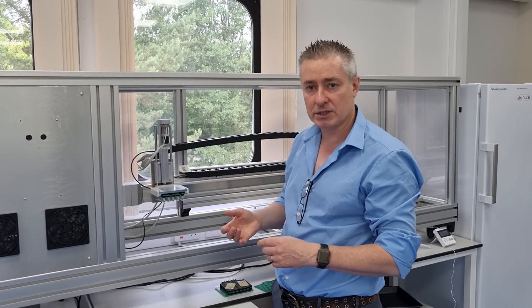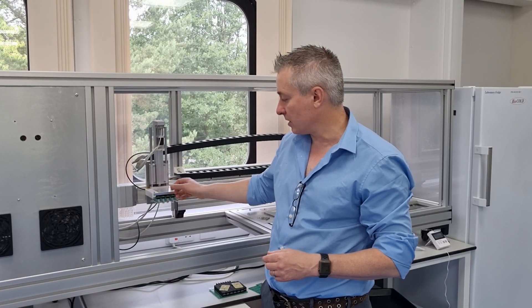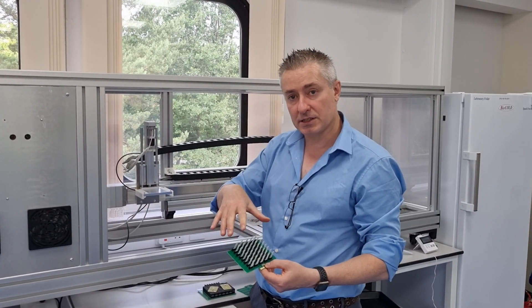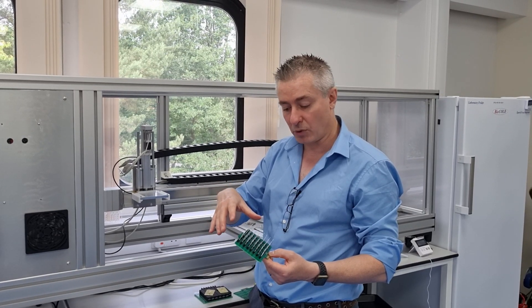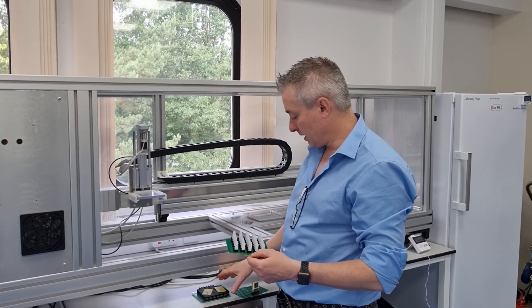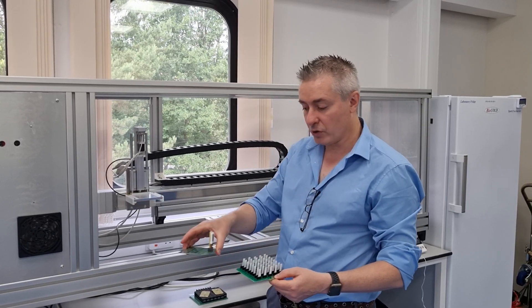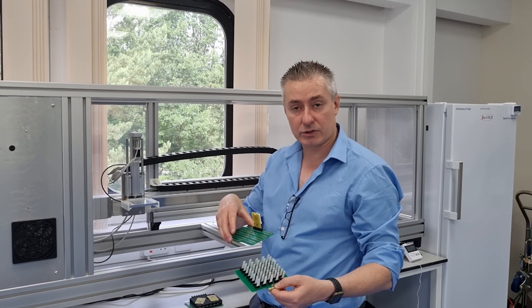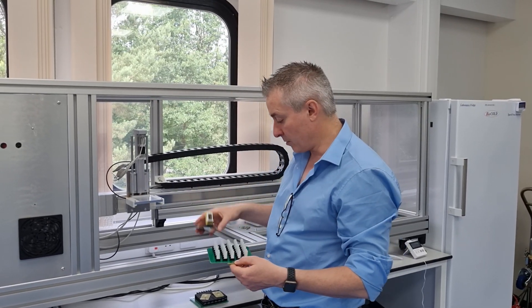We can do additions and washes, but we can also do electrochemical steps as well, because the PCB allows us to address these screen-printed electrodes and do things like modifications of the electrodes. As you can see, we have other versions of the PCB, so we can change the types of electrodes that we're putting onto the robot.